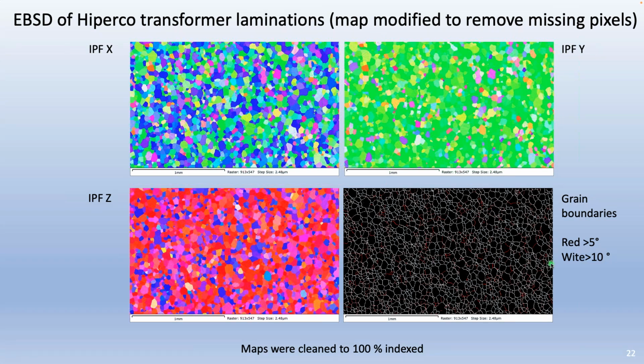But I think if you're trying to find a microstructural feature that tells you that you have a good bond across your pinch tube, and again, EBSD is just a section, right? So there could be other sections where the weld isn't quite so good. But generally, when I've done this sort of work, we always look for grain growth across the interface.